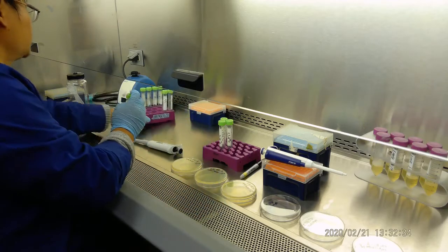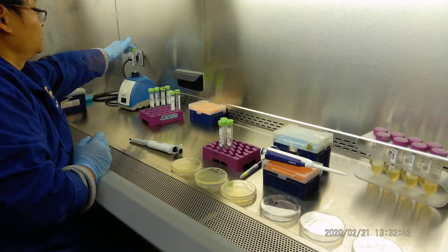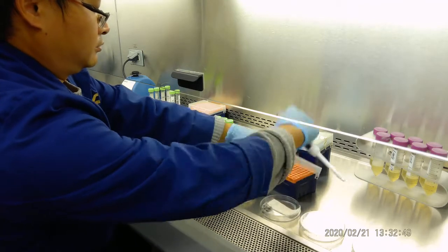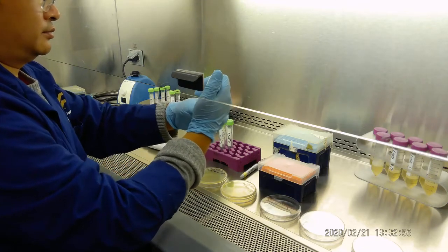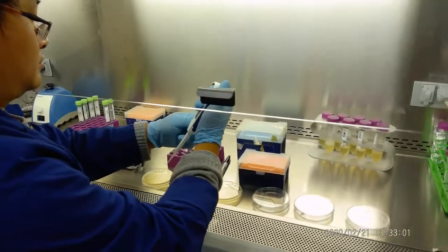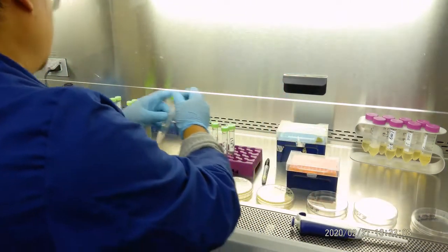Or we can do a vortex. So you can take a picture of us doing the vortex. Okay, that should be good. We are doing the vortex. Okay, now the first one, then the second one. Then we'll do the second step. So we can do shake, and we do vortex.